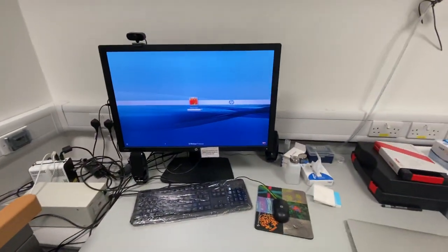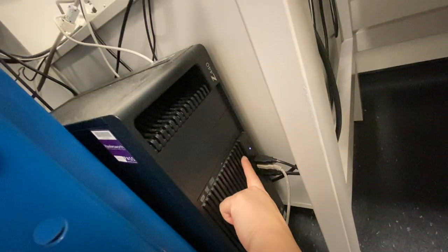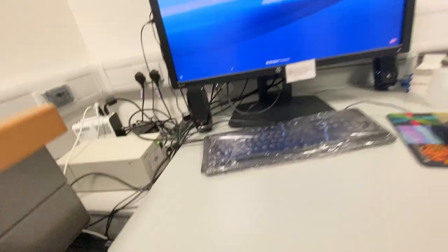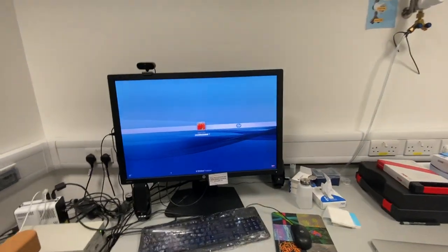And now if the computer isn't on already, you can switch the computer on here.